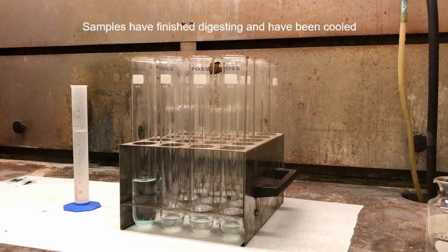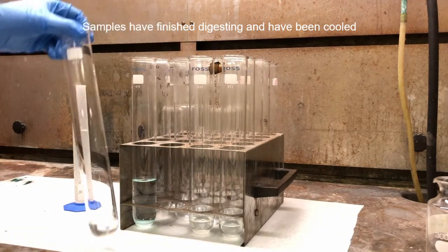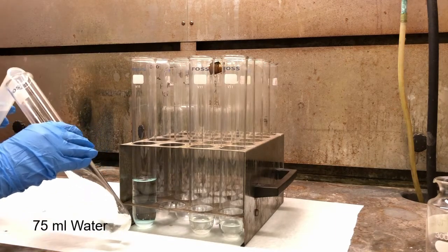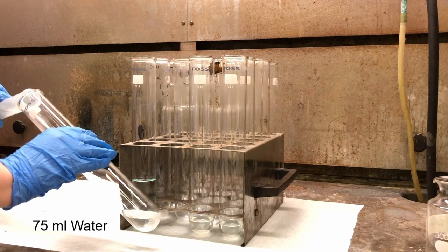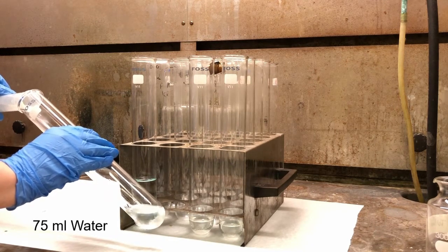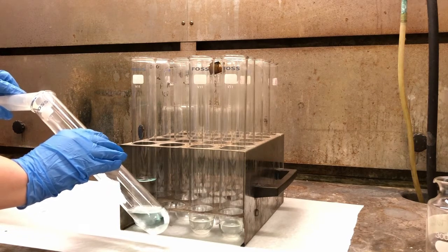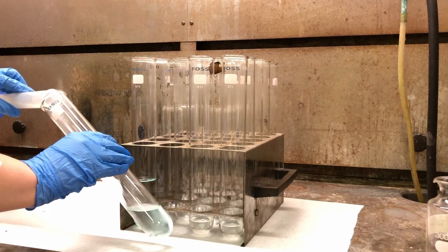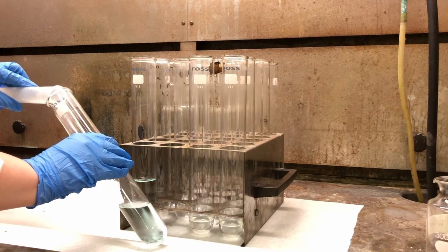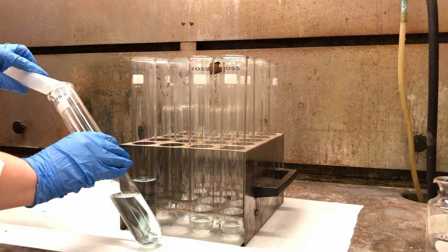So our samples have sufficiently cooled down. They're all digested. So now what we are going to do is add 75 milliliters of water to each one, just to dilute it before we do the distillation. So I'm just adding water, and I'm doing it carefully because we're adding water to acid. So we tend to get some vapors given off when we do that, which you can see there. So we're still working in the fume hood as well. So we add 75 milliliters of water.